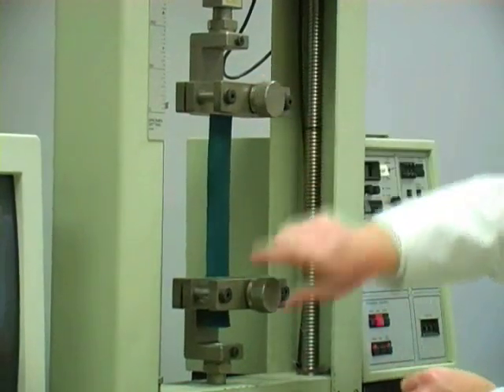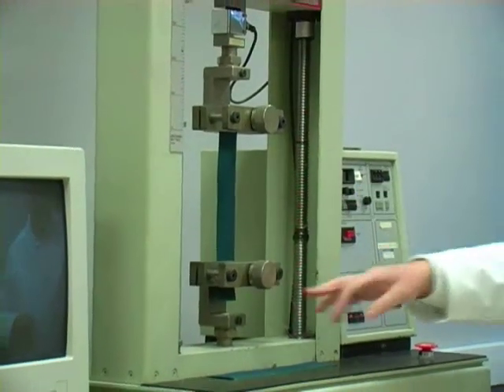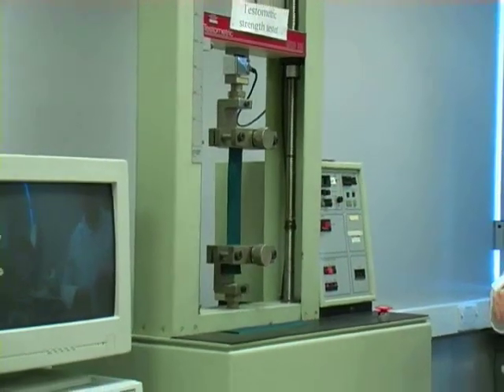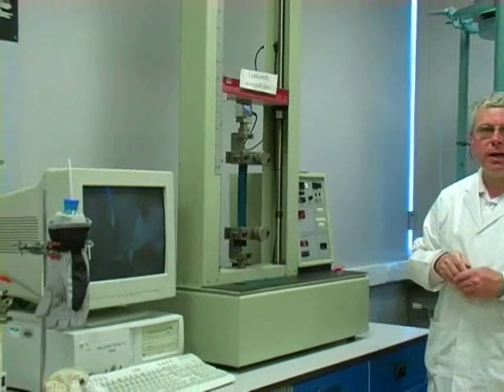So that's the sample in there. As I put the sample in, I pulled down gently on the lower end of the sample to give us a slight pretension — that just makes sure that the extension is an accurate figure.